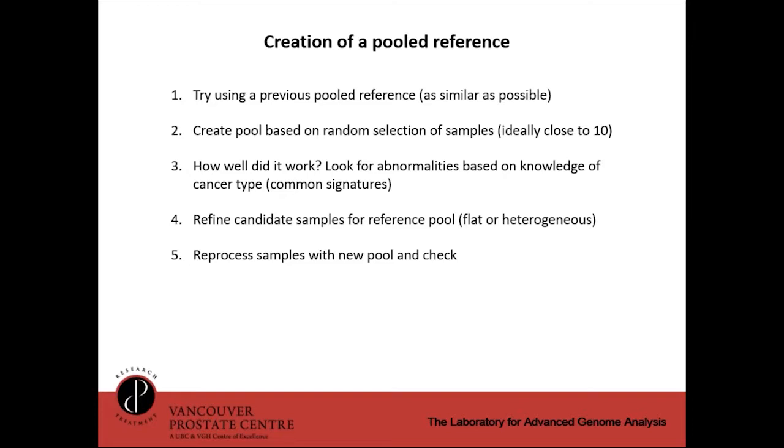There is a possibility that you can go and poach the reference from another project and stick it in there. It doesn't take long to try. You can just put that in depending on how many samples you've got. You can let this run for a couple of hours or whatever, and you'll know if that works. And that's probably one of the easiest things to do.